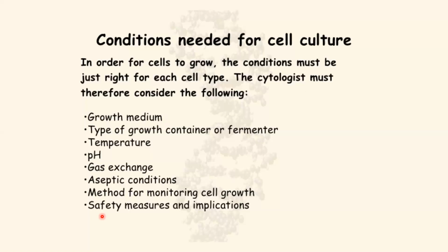So this means if you're working with some kind of tricky or dangerous cells, maybe virus, maybe cancer cells, maybe some neurons, maybe bacterial cells, Candida cells, and if you do not have the safety measurements, it's going to be bad. It might look really, really bad. So we have to have safety measures and we have to implement them. So a really strict implementation is really important to contain the stuff inside the designated labs.